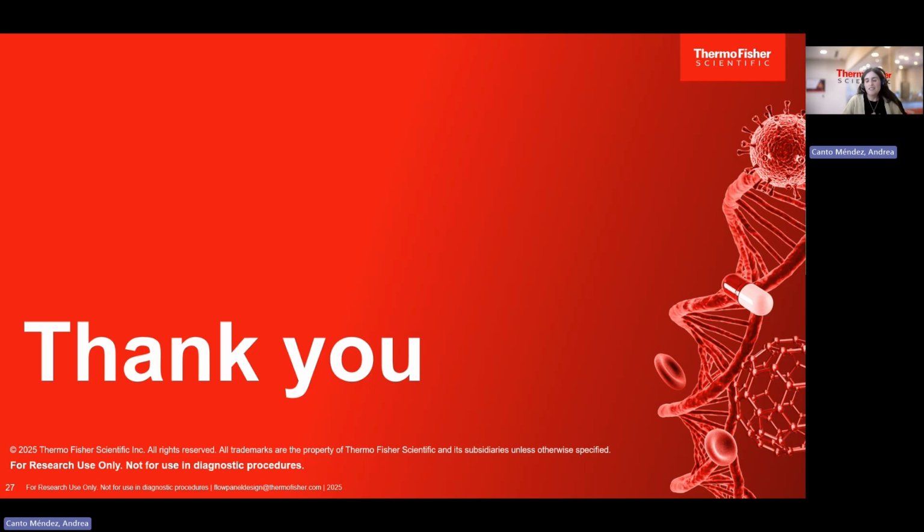It also depends on the system you want to analyze. If you want to analyze something very straightforward, like the activation by a couple of proteins, this might be easier to replicate in vitro compared to a very complex system like a multifactorial disease where multiple activation and inhibition pathways might be ongoing. So this is something that might need to be addressed case by case. But I would say the simpler scenarios are easier to mimic in vitro than the more complex ones.